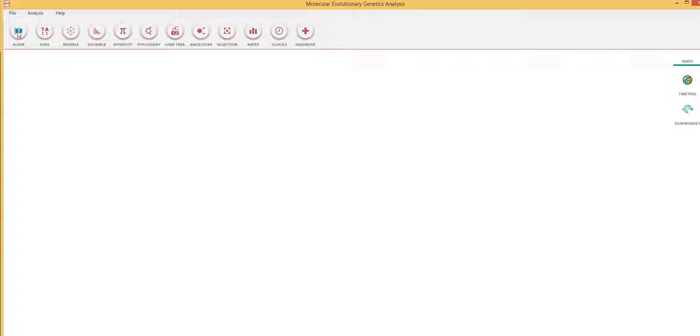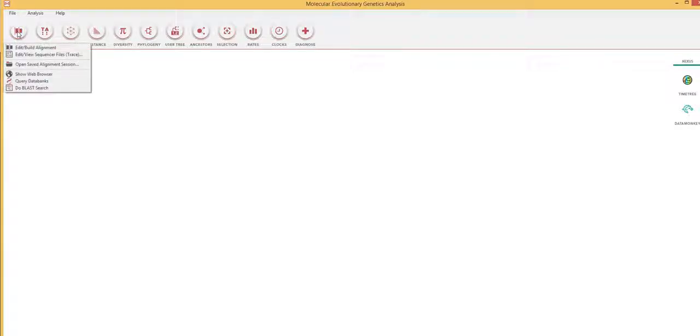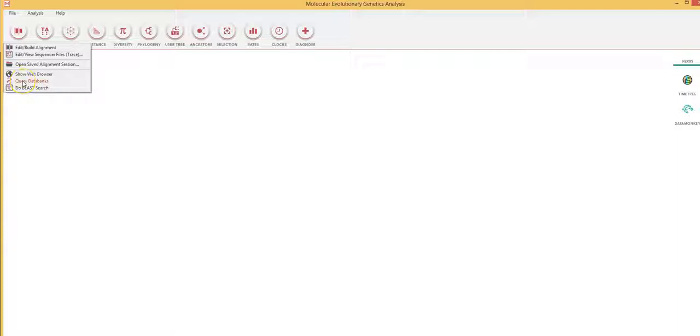Now I want to use this function to align multiple nucleotide sequences. So I click on align and I am offered multiple choices.